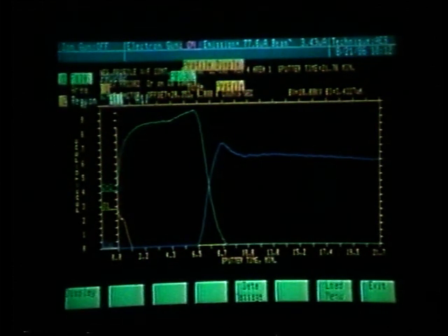So once again, we mentioned the differences between the point profile mode and the window mode, and also here I want to point out the differences between the continuous and alternate profile. The continuous profile being that the data acquisition time will be the same as the sputter time, whereas in the alternate mode, the sputter time will be the actual time that we sputtered the sample, but the acquisition time must be added on to that, the acquisition being alternately collected when we were not sputtering the sample.